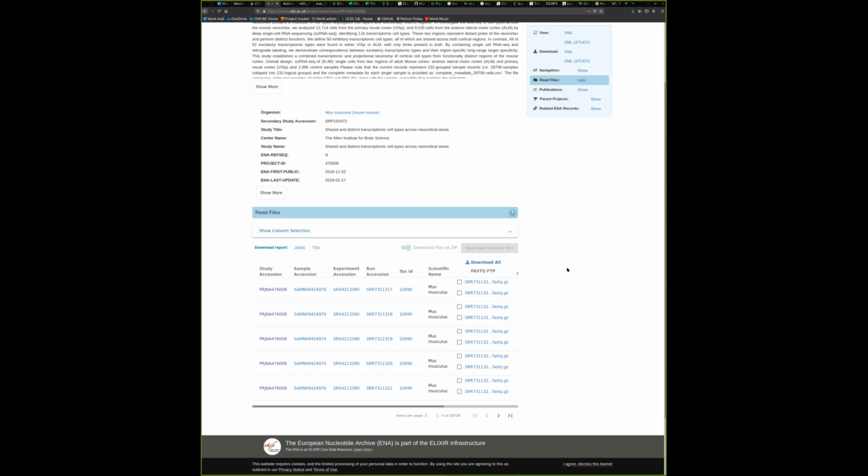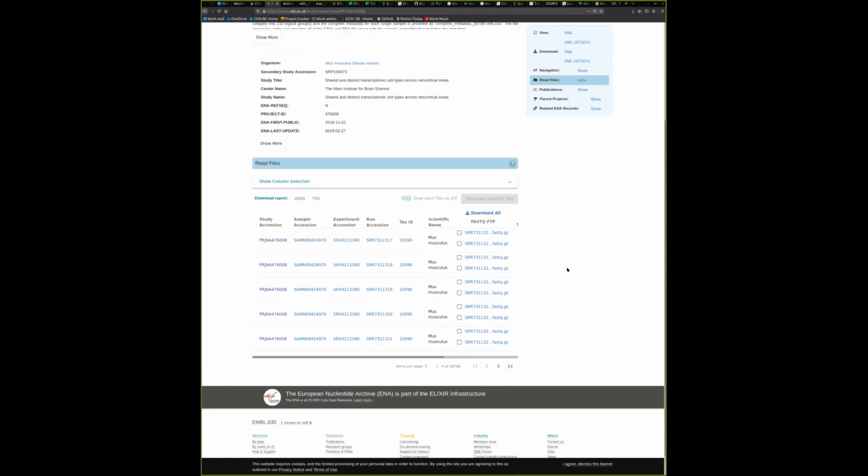You can search for your experiment. I found out that even if you go to a publication and it specifies a GEO accession, you might be able to get the data from ENA. Somehow they do keep data from all different publications in both repositories redundantly. So I guess that's good. So we can play around with both repositories. But the reason why I'm showing you ENA today is because it's easier to download or retrieve the FASTQ files using the terminal as compared to using GEO.